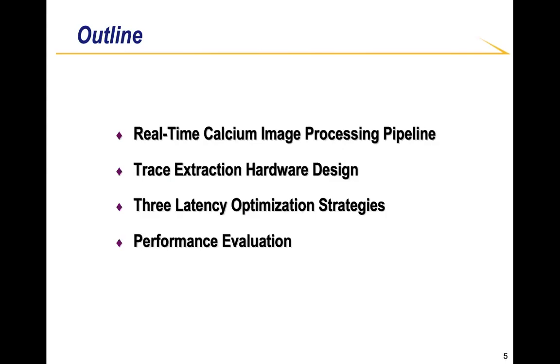The outline of our presentation is organized as follows. I would first like to introduce our real-time calcium image processing pipeline. Then I'll spend a few slides mainly introducing our trace extraction hardware design. Following that, I'll present 3 latency optimization methods we proposed to help meet the latency target. And finally, I'll show the performance evaluation.